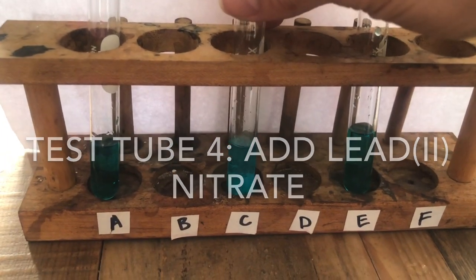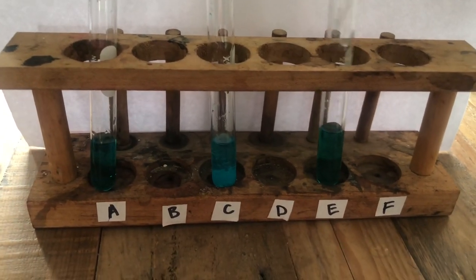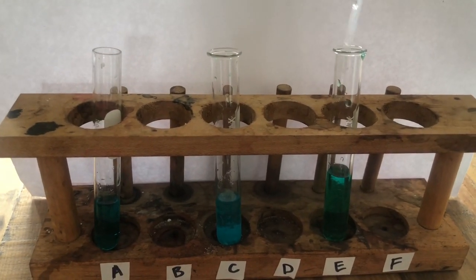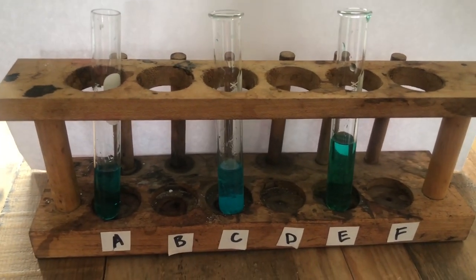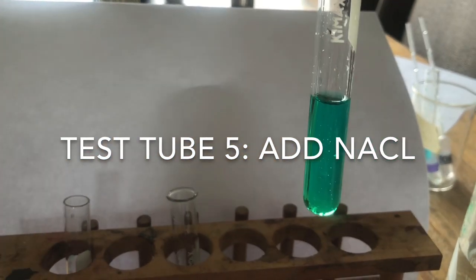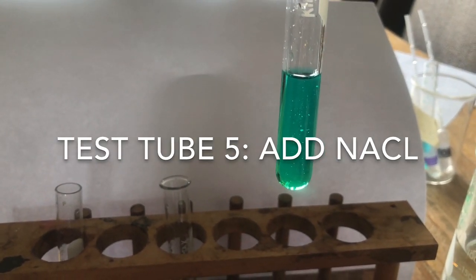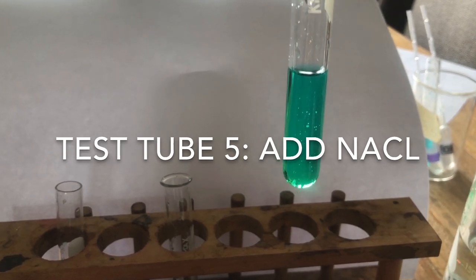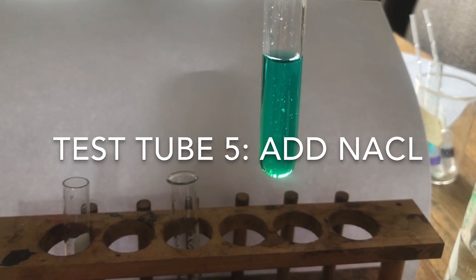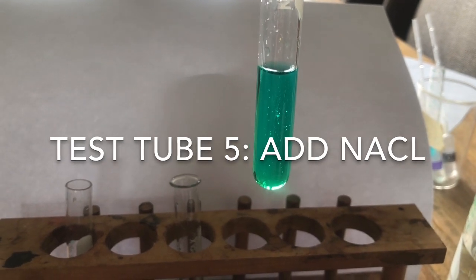Now, the last change we're going to implement is adding sodium chloride. Adding sodium chloride in the aqueous form, what that does is it adds a source of chloride ions to the solution. So I'm increasing the concentration of chloride. And when I increase the concentration of chloride, the reaction is going to shift to the opposite direction. So it shifts to the left side of the reaction, and on the left side of the reaction is where the reaction is green. So you can see that solution turns more green.